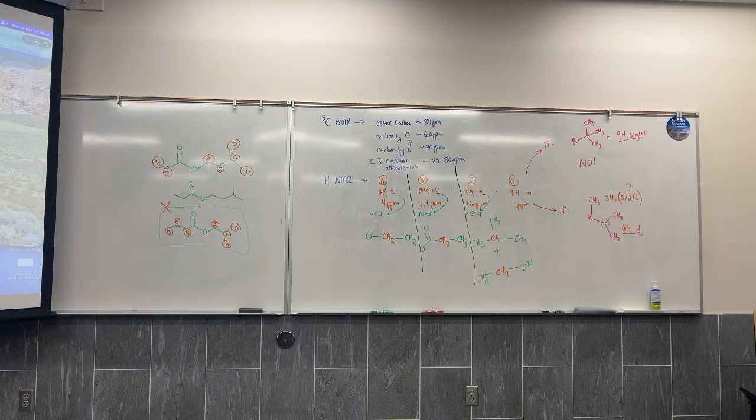Yes, Gavin? How again do we determine it's a 3H and not a 1H? Oh, proceed, because I messed up. What determines the H again? Integration is where we get this.